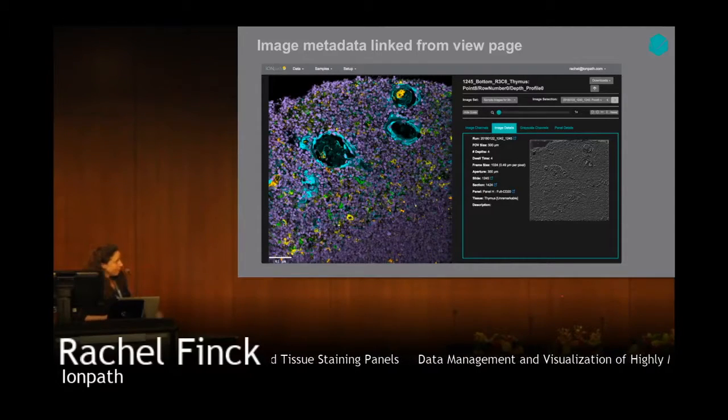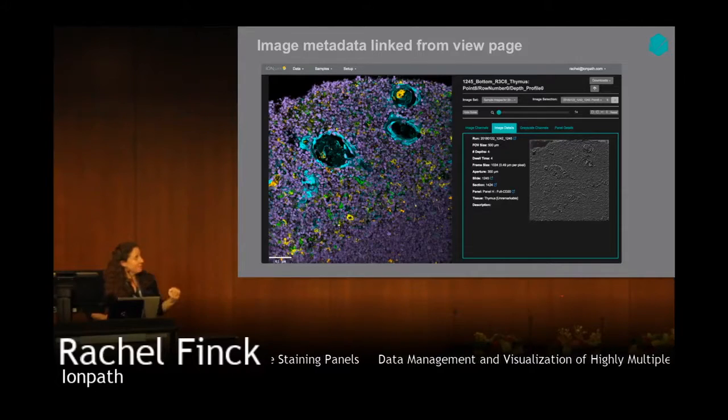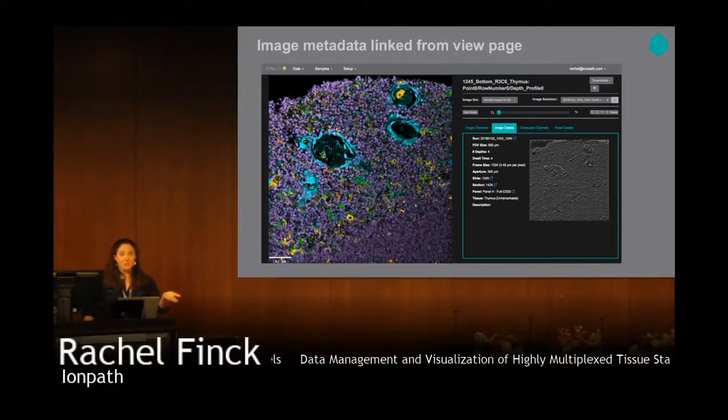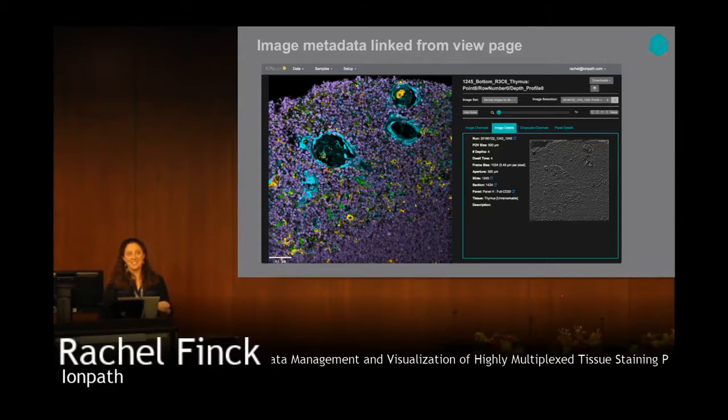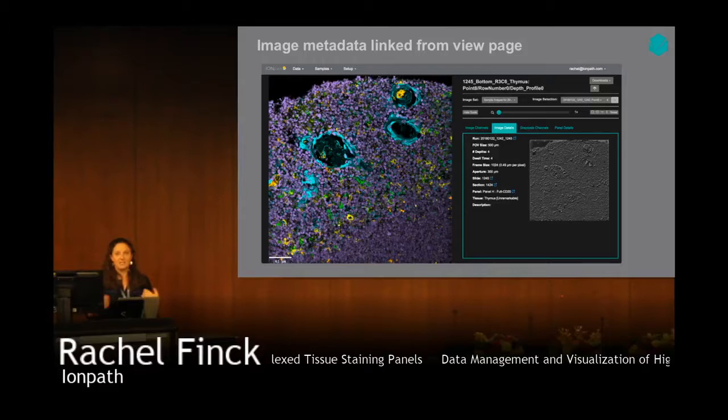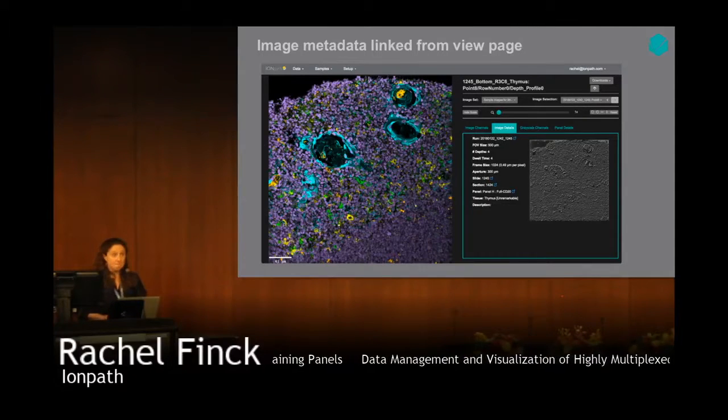Quick aside, what you're seeing there is a secondary electron image of the tissue section, because there was a question at the end of Liat's talk about how to choose the field of view, and that's an image that you get in almost real time. There's maybe less than a second delay of refresh from the top to the bottom of the image that rasters over it, but you can see that and it helps you choose your fields of view at the MIBI as well, when talking about field of view selection.